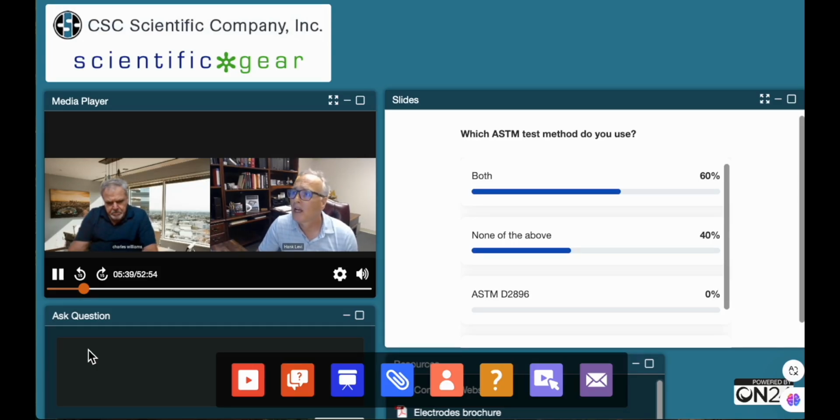I find that interesting. I know some of you out there, we have done some on-site service training, annual PM, and some on-site training with you. So some of this is review for you, but we know that two ASTM methods are being used. And I think, Charlie, you might agree, sometimes it's like, are you using both of them because you have to or because you want to? Meaning, sometimes the specification just says you've got to use both methods, and that's the answer. If you're writing the specification, too, that matters.